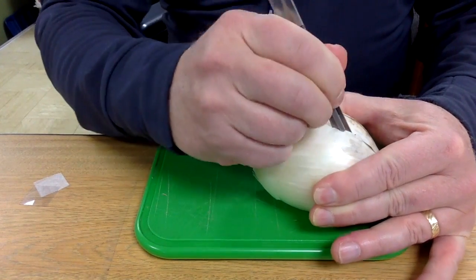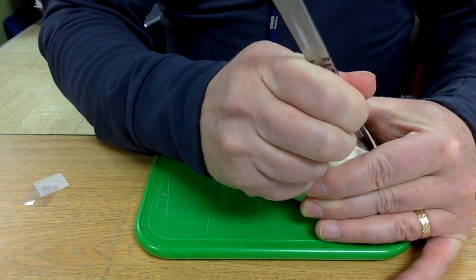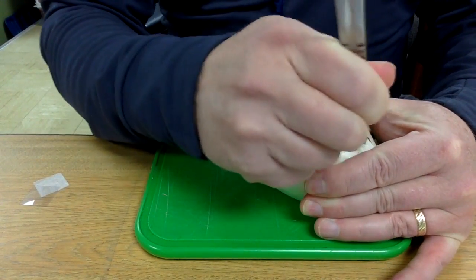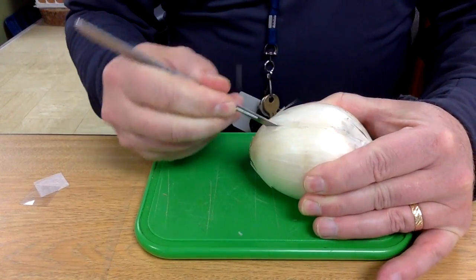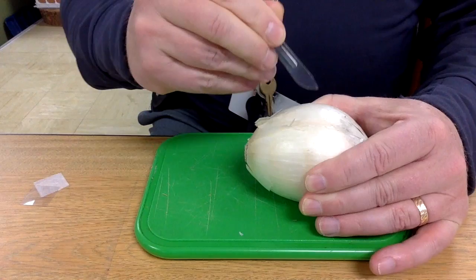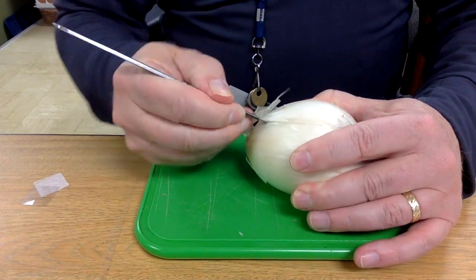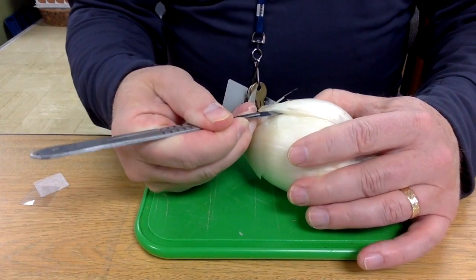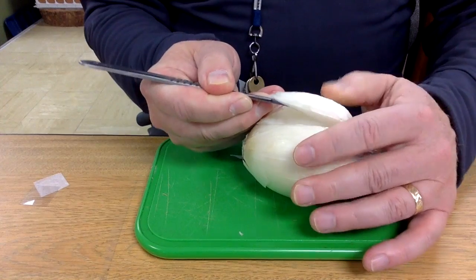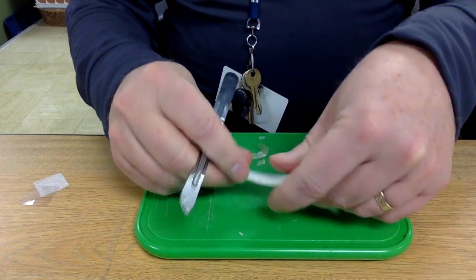Onions are chosen for microscope viewing because they are a eukaryotic cell that is comparatively large. We get a nice view of a plant cell, and from this part of the plant we're not going to run into too many issues with chloroplasts that would make it difficult to see other structures.